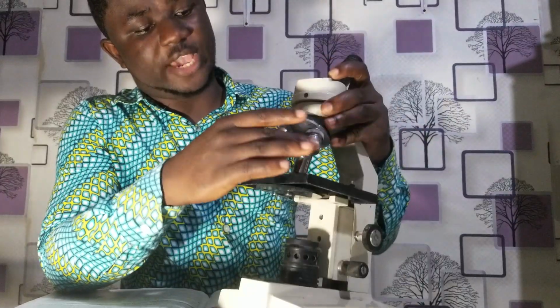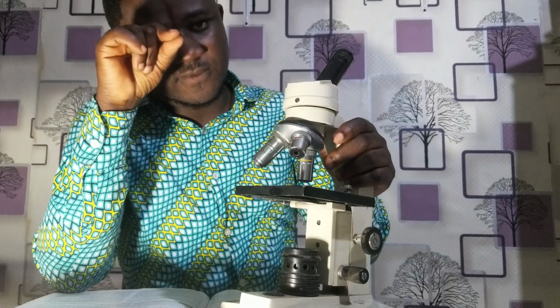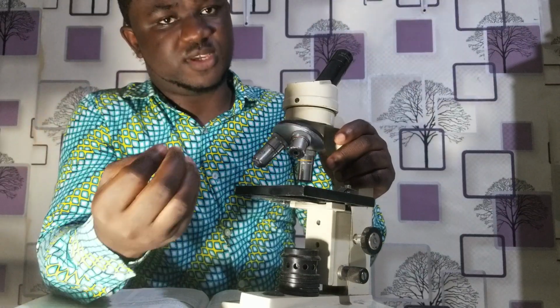This is a monocular microscope because it has just one eyepiece lens. Most of the microscopes that you've seen are binocular microscopes because they have two eyepiece lenses, but this just has one. So this is an eyepiece lens. It is a lens that is going to enable you to see the final image that you're forming in the microscope. And these are your objective lenses. These are the lenses that pick up the details from the specimen.